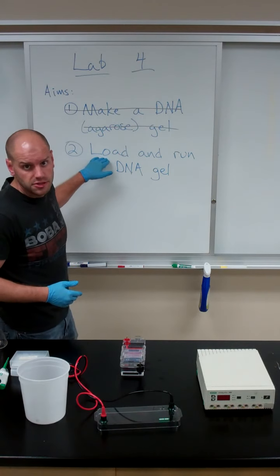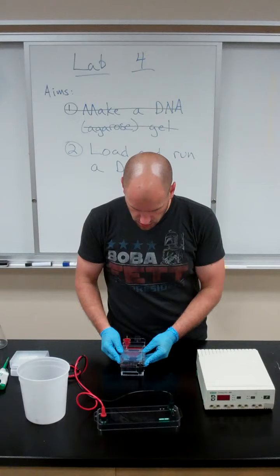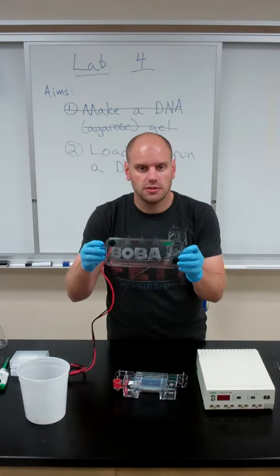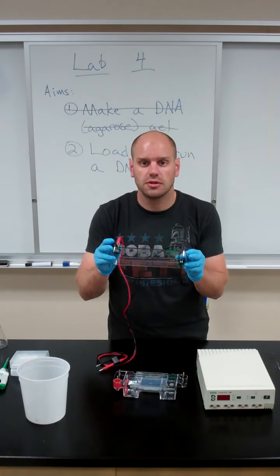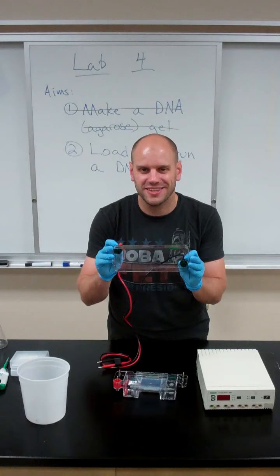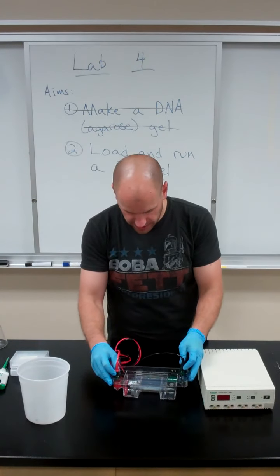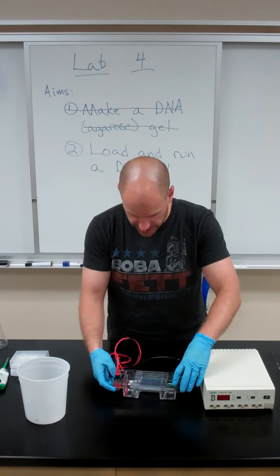Once you've loaded all of your samples, you and your groupmates, you're going to want to place the cover onto your gel housing. Now remember, these are color-coded so that you can connect the right lead to the right anode and cathode. So red goes to red, black goes to black.